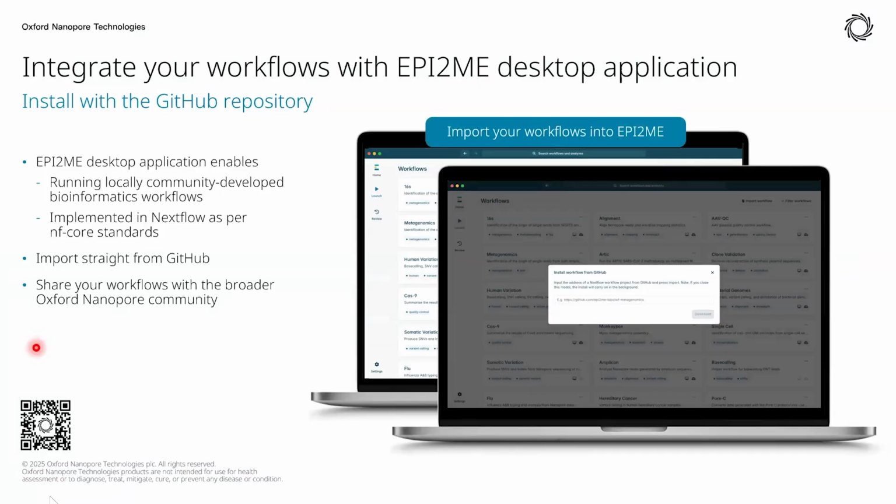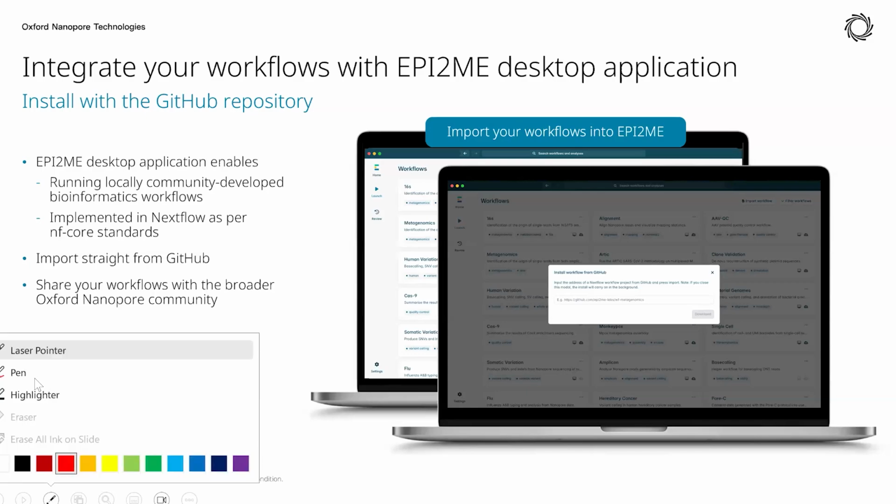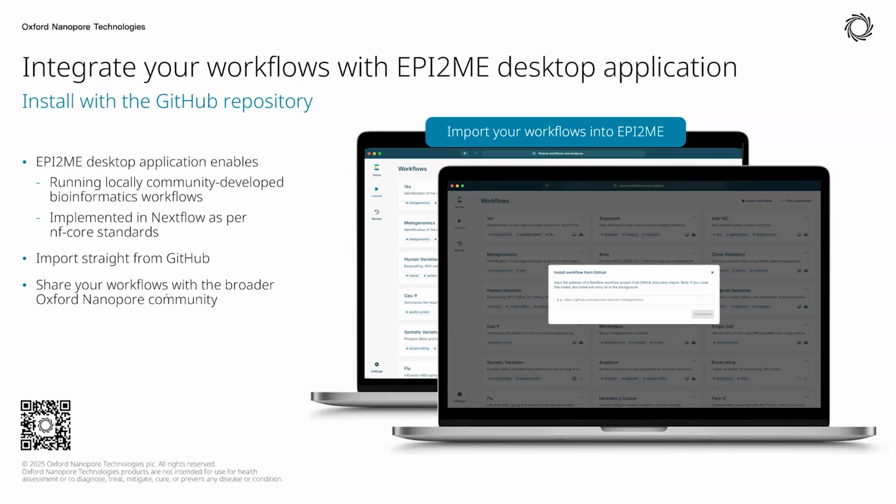Okay. For EPI2ME, again, you can import your own workflows into it. I do have a few that I use fairly frequently for QC of Nanopore data. I believe there's also an alternative metagenomics approach available, the EMU package. And there's also, we've deprecated our own SARS-CoV-2 pipeline.